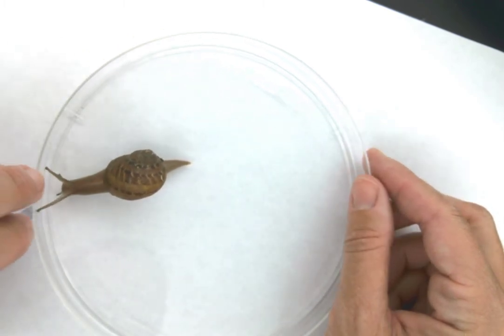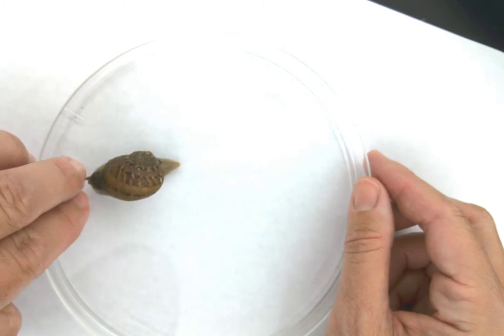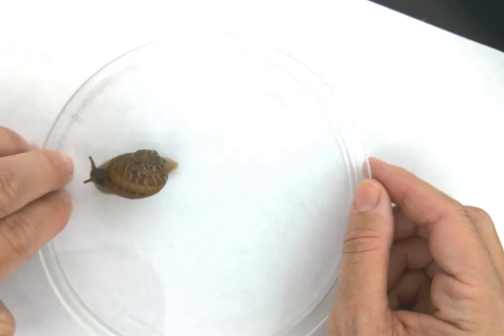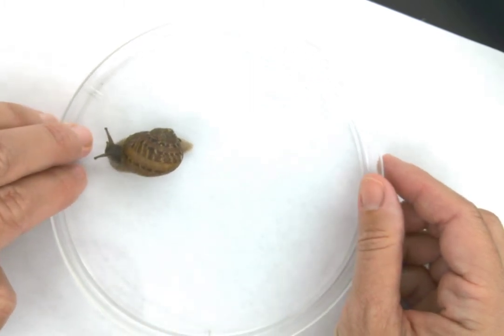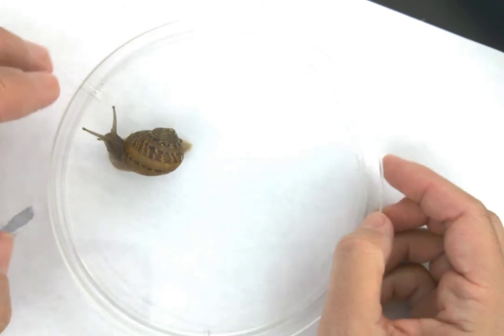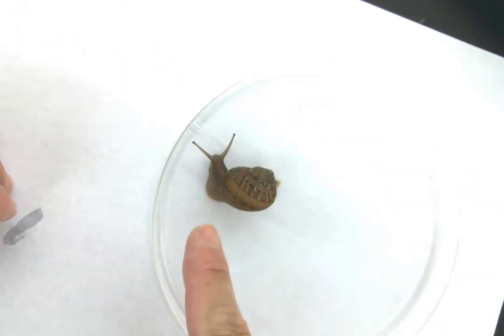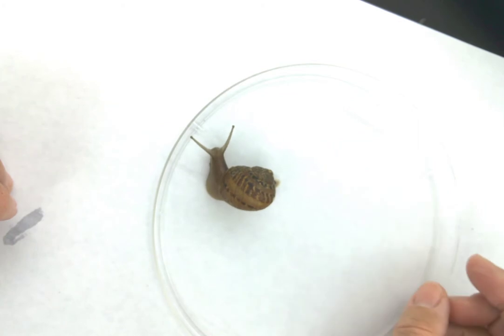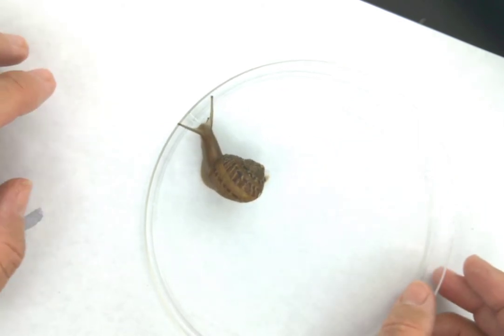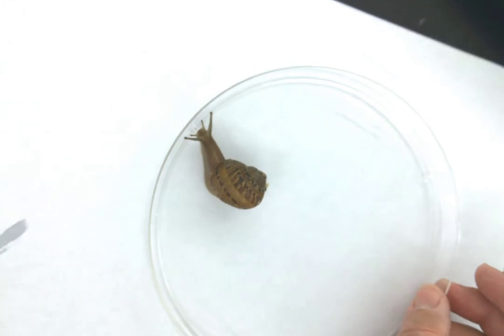So if I'm a predator, what's it doing to protect itself? Pulling itself back into its shell. What structures does it have that allow it to interact with its environment, sort of check things out around it?